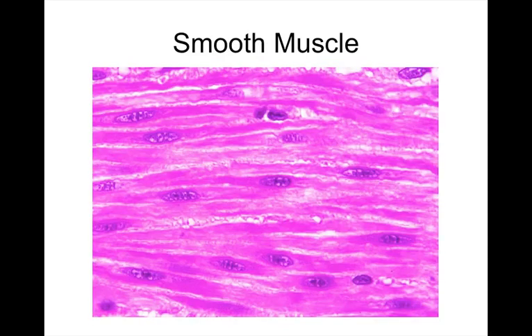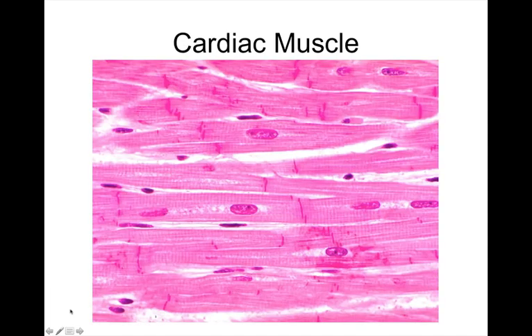Smooth muscle doesn't look like anything. So the smooth muscle cells have single nuclei compared to the multinucleate cells we saw before, and they are arranged in perpendicular sheets, and some of the cells would be elongate versus circular. And one important thing to note is that this type of muscle isn't striated compared to the skeletal and the cardiac. Right, so this would be an individual smooth muscle cell. So they're kind of tapered in their appearance, and no striations, because as it turns out they do have contractile proteins in them, but they're just not arranged in the super regular fashion like you see in cardiac or skeletal muscle.